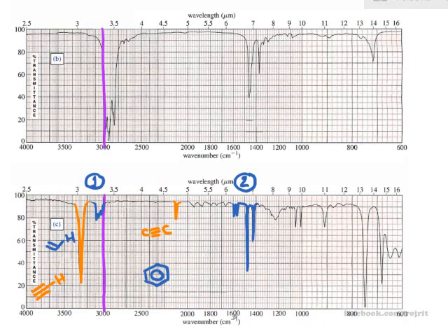At 1600 to 2000, you will see a little bump, maybe 4 or 5 bumps. This bumping is another characteristic of the benzene ring. And the last characteristic of the benzene ring is around 600 to 800 in the fingerprint region. At 600 to 800, you can see a strong absorption, normally appearing as 2 or 3 sharp peaks.